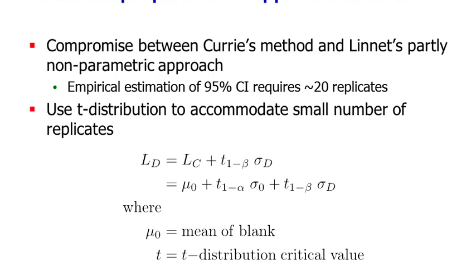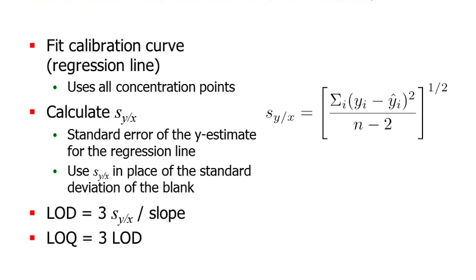But that may not always be the case. Like the examples that Sue showed, some of them had a slope of like 1.01, others may have a slope of 0.97. So the slope may be slightly different from 1. And in order to account for that, you kind of divide by the slope. So this you can apply in general, irrespective of which method you use, but in this method it's explicitly taken care of.